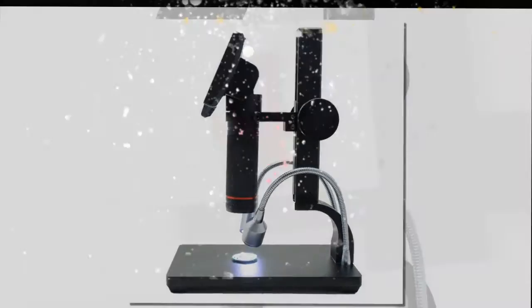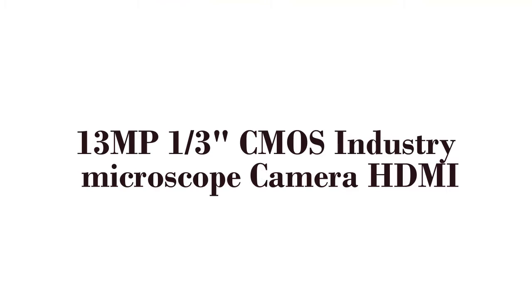Here is product number 4. 13MP 1/3 CMOS Industry Microscope Camera HDMI.